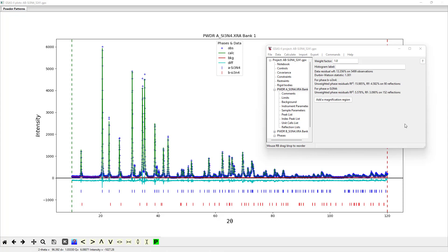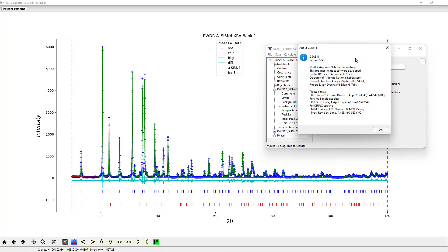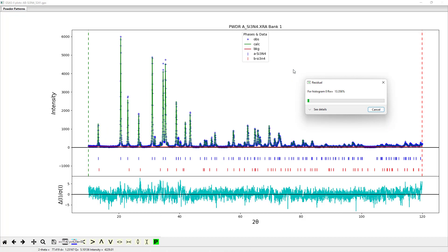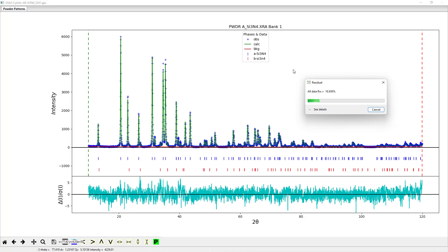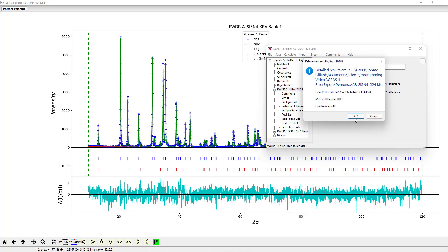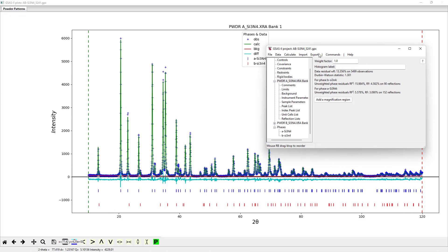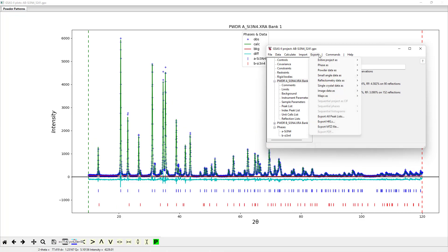The first step is to ensure that your GSAS-II version is 5241 or higher. If you wish to use this feature on a model that was developed using an earlier version of GSAS-II, you may need to perform a refinement cycle to ensure that this feature works as intended.